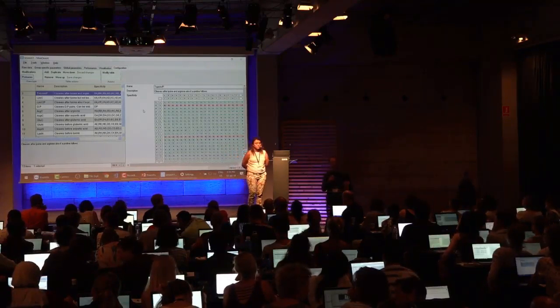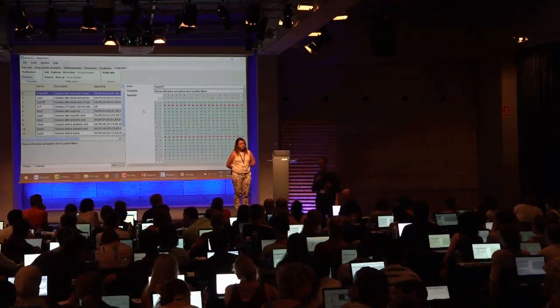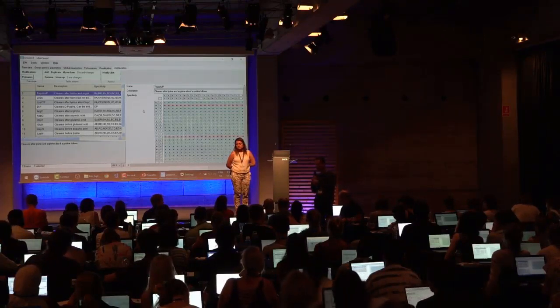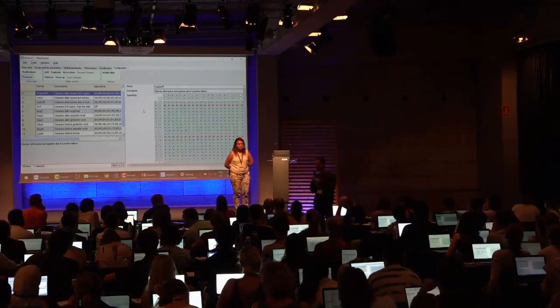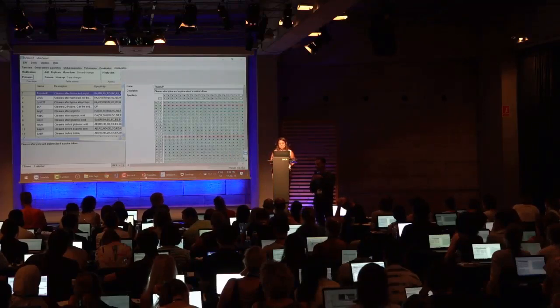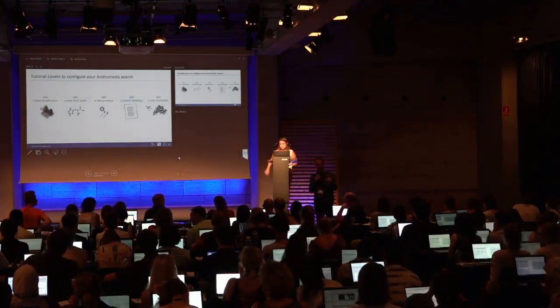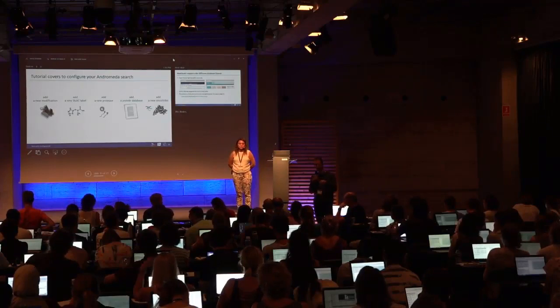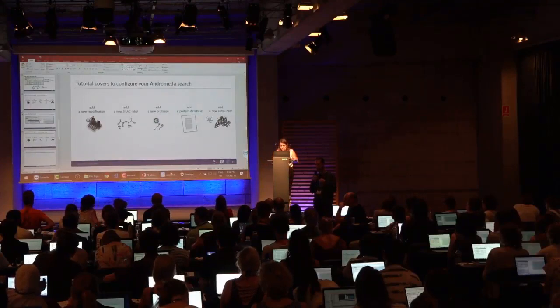So one more unrelated issue that I saw, a few people have issues with saving the table, access denied, and I think this happens because some of you might have the MaxQuant installation in a place where you are not allowed to overwrite files or create new files. So for example, if you're not the system administrator, you're maybe not allowed to write in some places. So just grab your entire MaxQuant folder and move it somewhere personal, for example, the desktop, just for now, and then you should close MaxQuant, open it again, and then you should be fine to save the configuration.